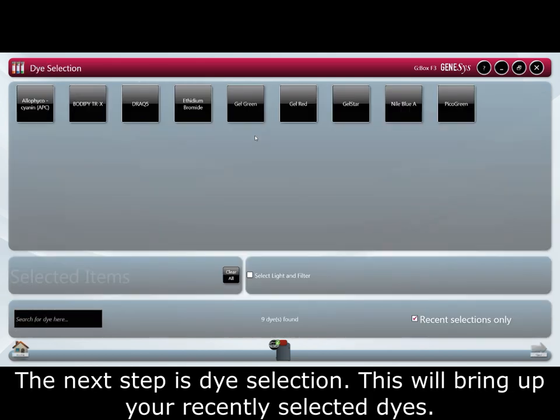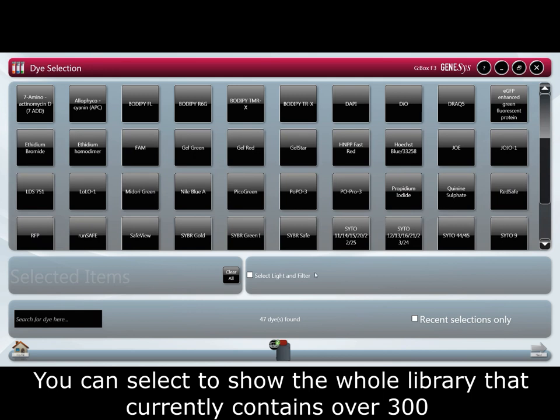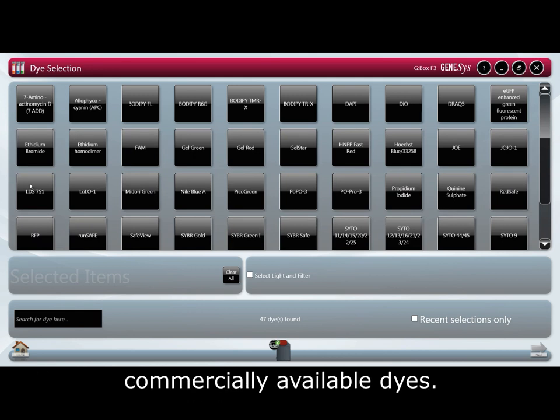The next step is dye selection. This will bring up all the recently selected dyes. You can select to show the whole library, which currently contains over 300 commercially available dyes.